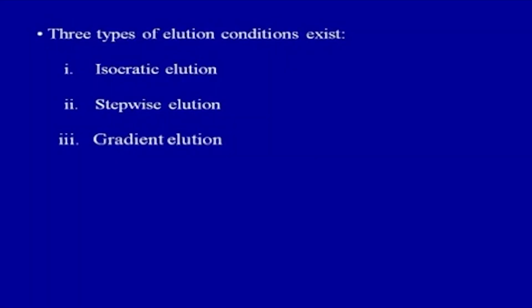Then there is stepwise elution. In stepwise elution, a sequential discontinuous change in pH or salt concentration will be done. For example, you can change pH sequentially, like you can first start with say pH.